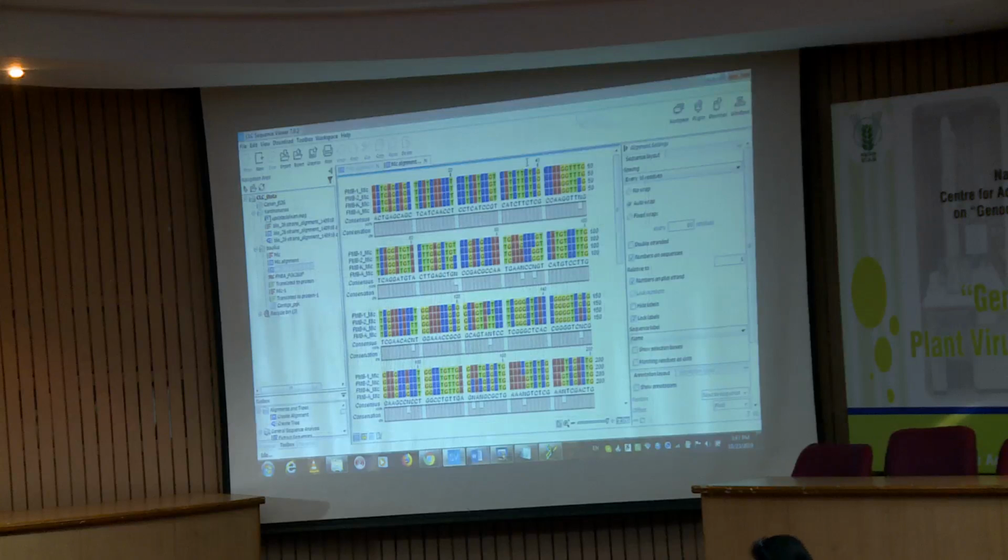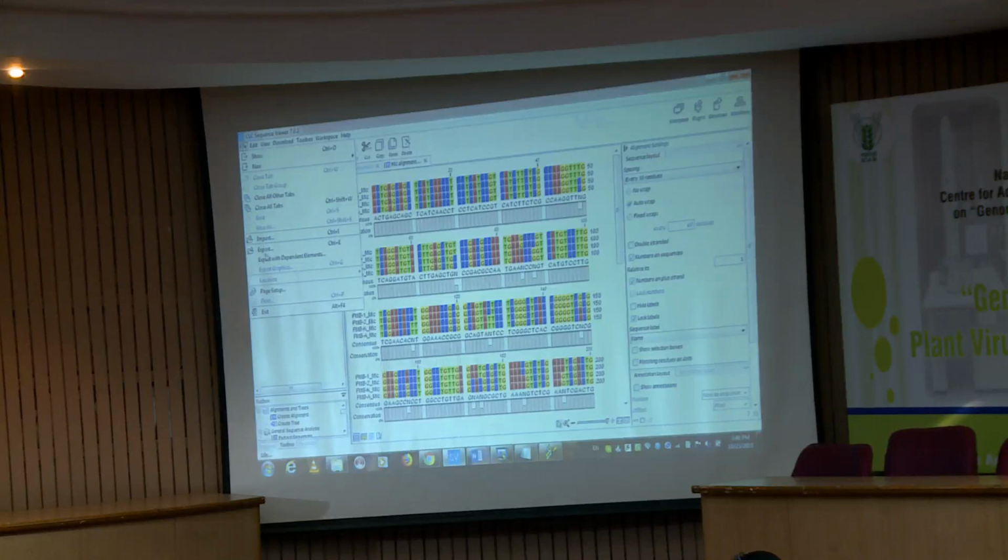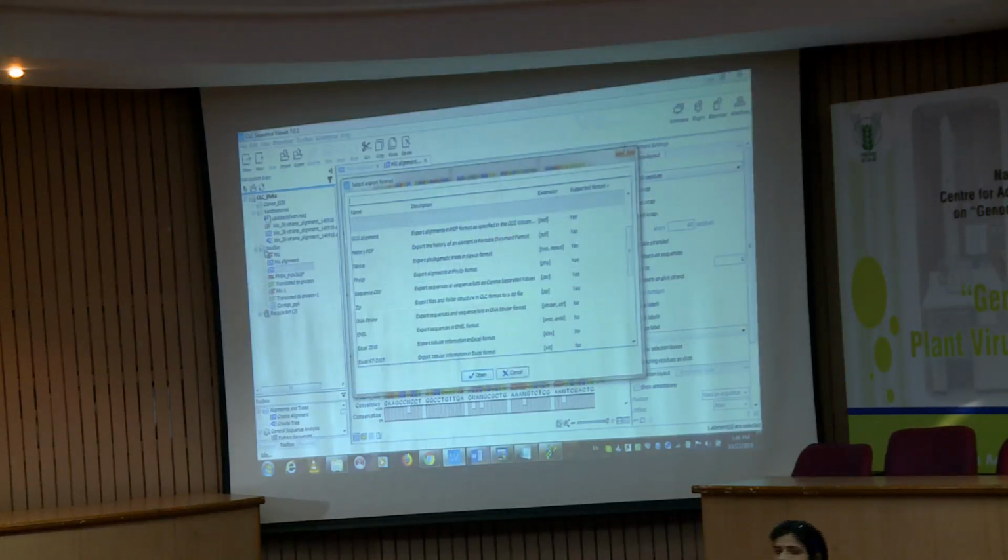Now after completing this exercise, you can export these edited files to make one document. How can you do this for the aligned file? There is one option: select this file, go to File, Export. Your trimmed and edited version will be exported to a text version, which you can use further for your downstream process.